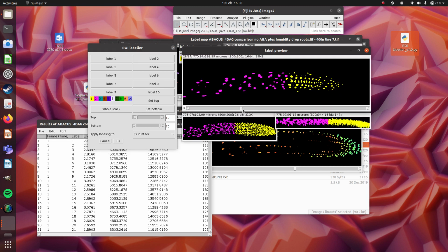And then I'm probably going to give this bit exactly here as label 3. You know, this is very rough and ready, but you can see that around here the nuclei start getting further and further apart, signifying the end of the meristematic zone, and that they're entering the transition zone, and here's the elongation zone.